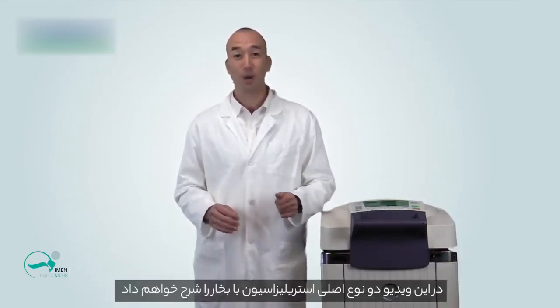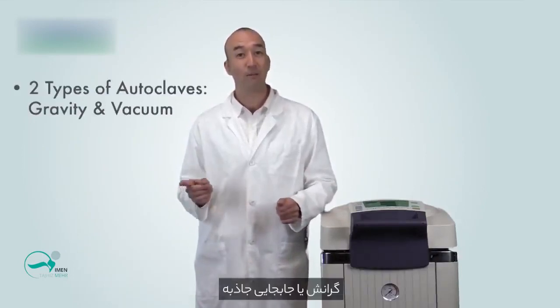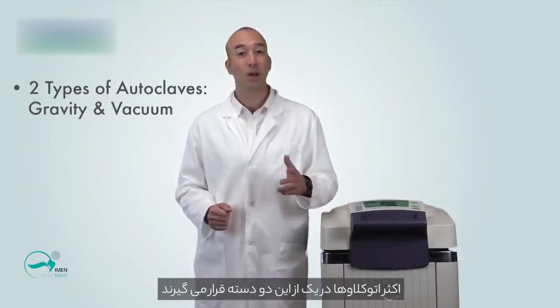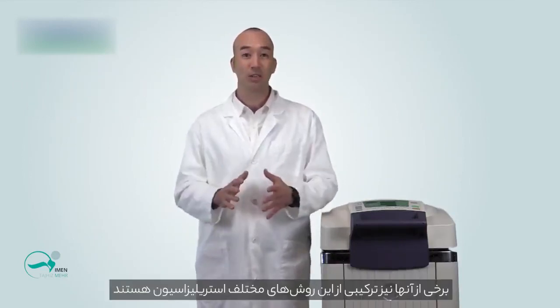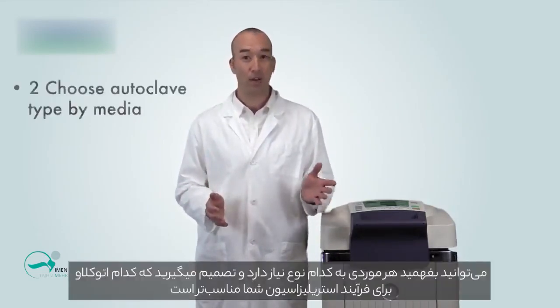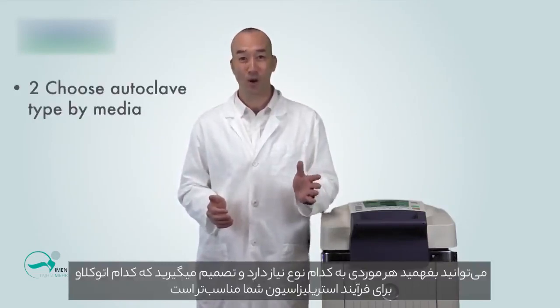In this video, I'll be going over two main types of steam sterilization: gravity or gravity displacement, and vacuum-induced or pre-vacuum, also known as pre-vac sterilization. Most autoclaves fall into one or the other category, though some use a combination of these different sterilization methods to sterilize. By understanding the difference between gravity and vacuum autoclaves, you can understand which types of media require which type and make a decision on the autoclave sterilizer that's right for you and your operation.